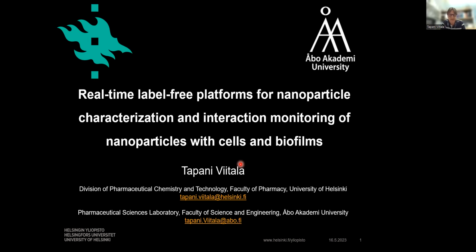I'm a real advocate of this real-time label-free measurements because I think real-time measurements are very important. If you look at our body itself, it's a very dynamic system, and many times we do in vitro studies in static systems. In the body, brain activities take place in milliseconds, cellular uptake processes take minutes, and cell division takes place in hours. So it's a very broad time scale, and therefore I always like to look into the fact that we can measure something in real time so that we can predict what happens. And label-free is quite obvious because if we label something, we can modify some of our material properties.